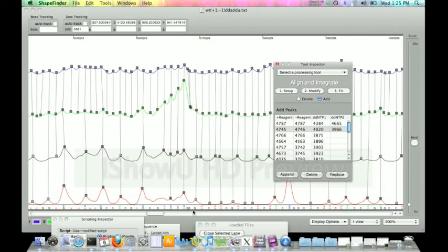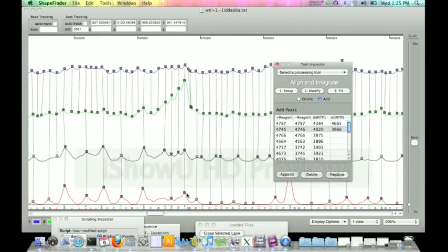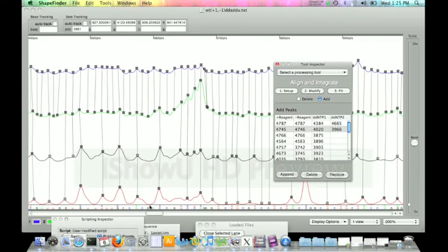So there we go. You can see there's some unequal spacing between the nucleotides, but what's important is that our data is helping to line up a little bit better. So we see that this U here lines up with this U, and our A is under a pretty decent sized A peak. Again, here we have an A shifted off under this peak. So what we really like to do is get this A underneath this peak. So I can just go ahead and add a peak in between this area where I believe it's lined up and this area where it's not lined up. So this is the area where I need to add a peak. So we're going to go ahead and just drop something in there.